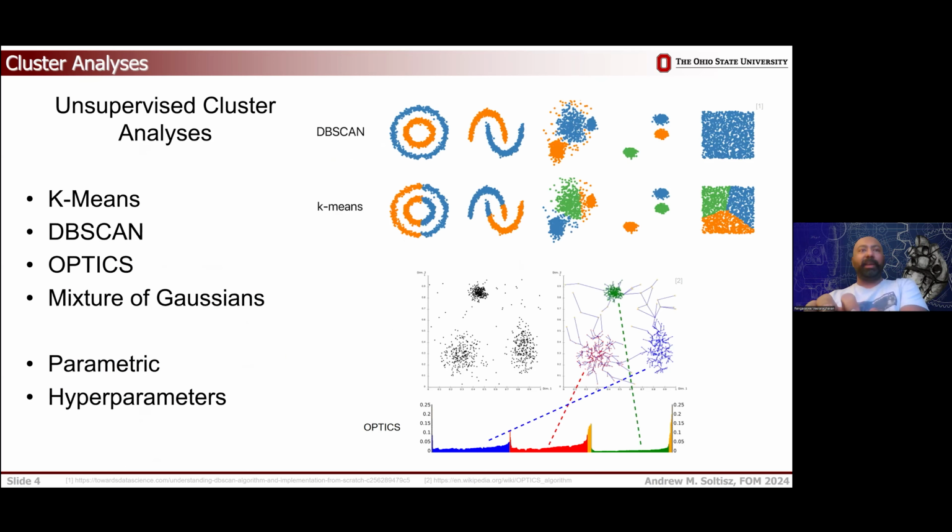Typically in continuous space, you don't want to process a single localization because if you measure distances between adjacent localizations, well, the same fluorophore molecule gets localized over and over again. It's been undergoing Brownian motion between those events. All you will recapitulate is that your fluorophores are undergoing Brownian motion, which is a powerful illumination of the obvious, which is not useful. So instead, you use various forms of unsupervised clustering.